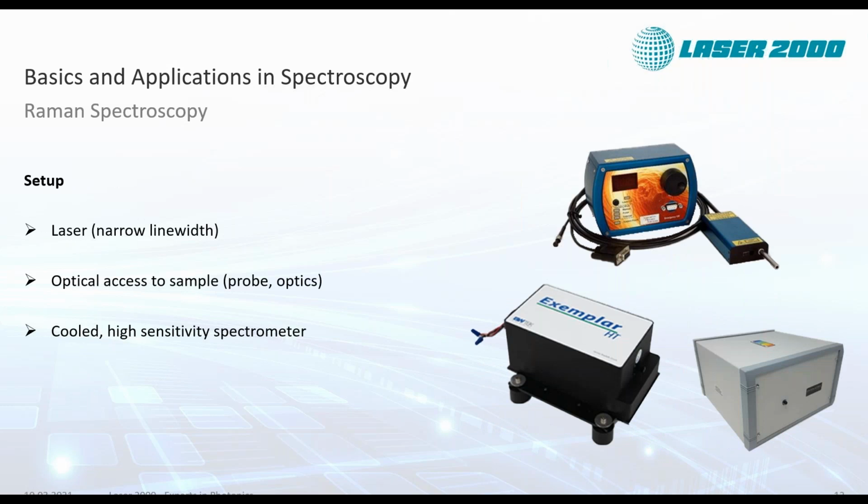A basic setup for Raman spectroscopy, very simple and easy to integrate, consists of a powerful light source, preferably a laser, and additionally preferable with narrow line width. You need some kind of optical access to the sample, which could be a probe, like shown beside the laser housing here, and a cooled and high sensitivity spectrometer.